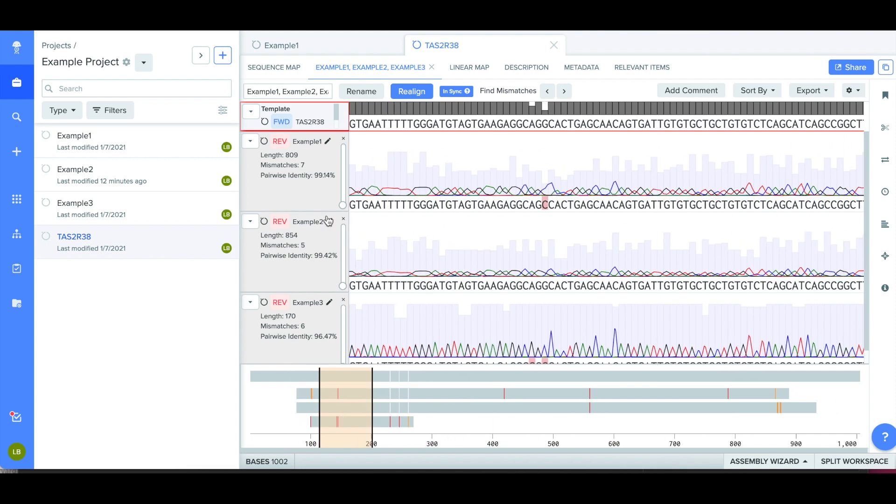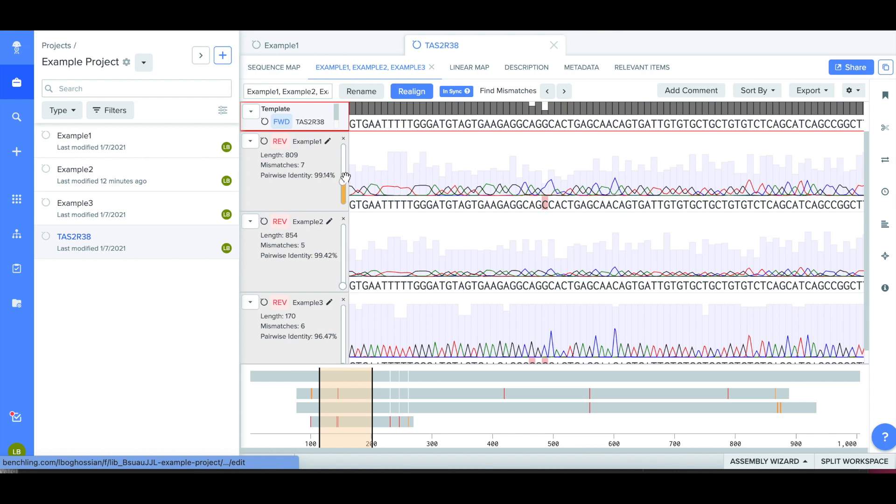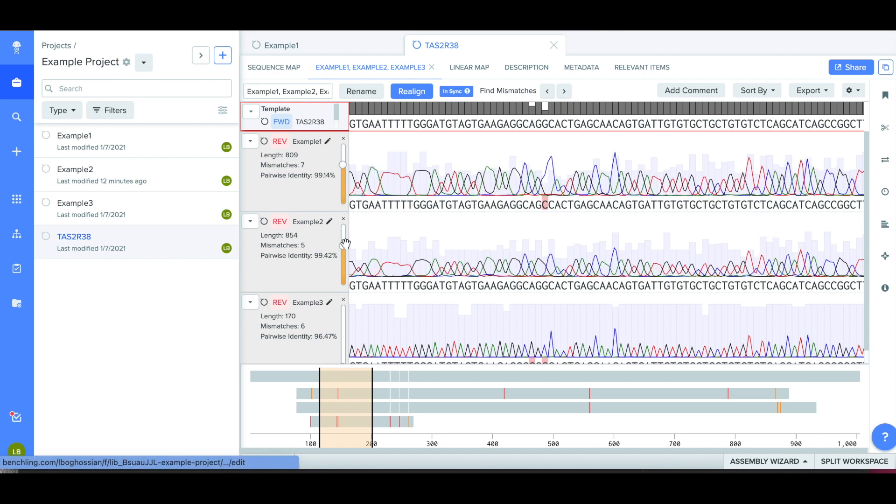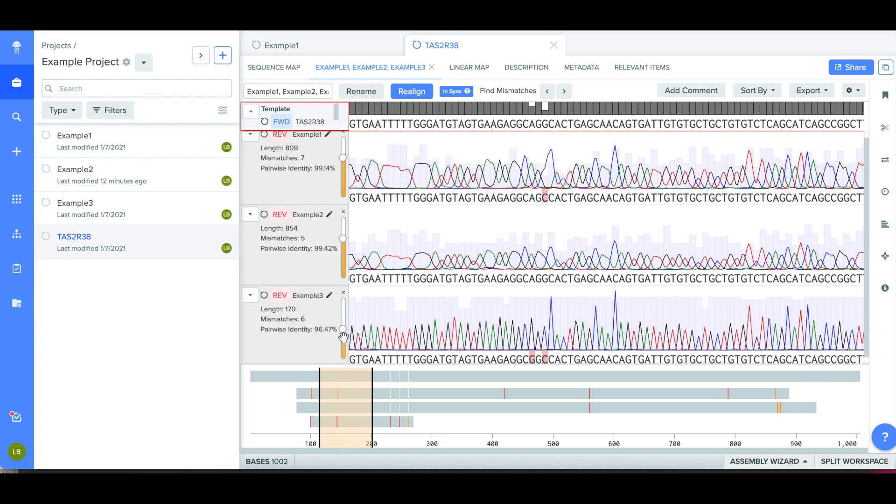You can also use the slider on the left-hand side of the chromatogram in order to change the way that the sequences are displayed. This can help you spot differences in the chromatogram peaks.